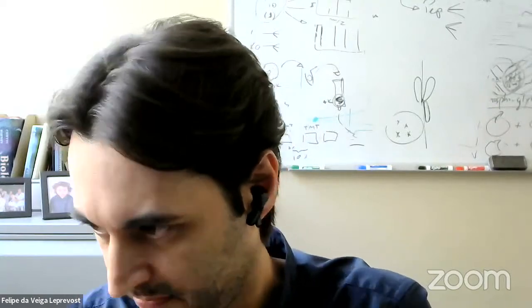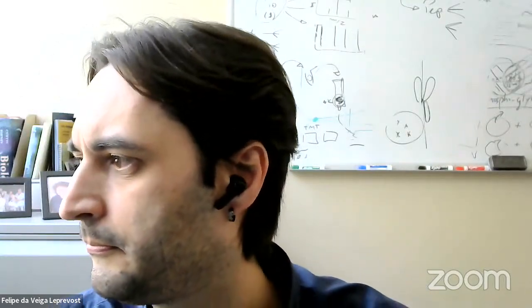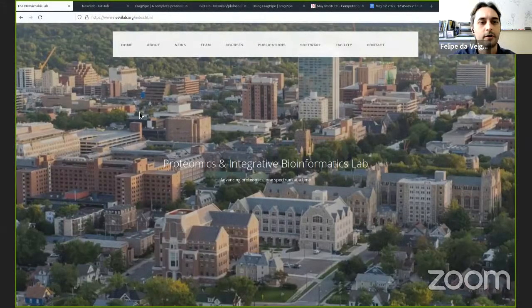So I'm going to start sharing my screen here. Okay, so I'm going to start showing how you can find more information about our group, about the tools that we make. I'm going to show you how to locate the programs and how to download them, how to get them right in your computer.